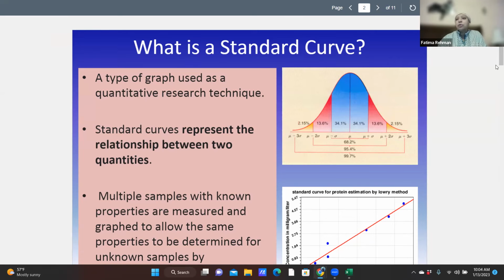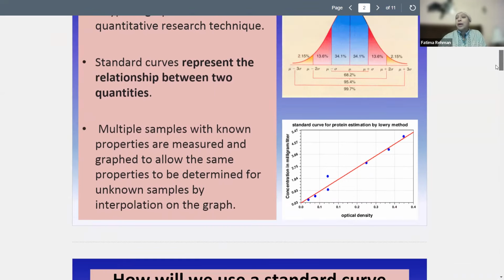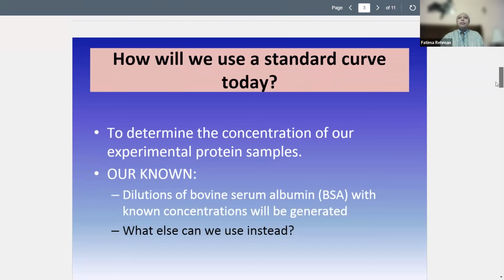And so, we always like a linear trend function if we can have that. Sometimes it's just not possible though. So be mindful of that, your samples or your particular assay that you're using to quantitate your proteins may not be very linear, and you may be stuck using one of the other equations. Maybe not always, but sometimes.